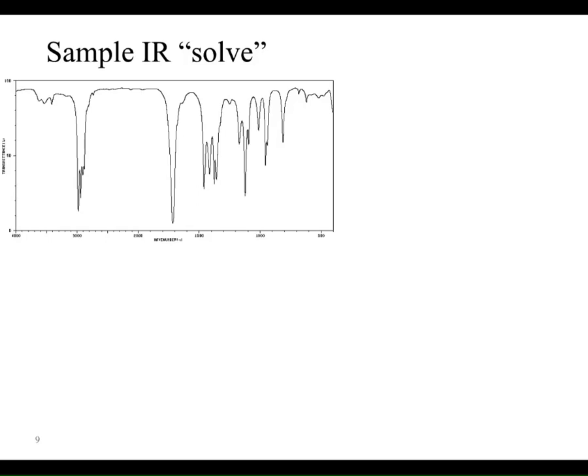So analysis: 3000, that's just under 3000. This is CH sp3. That's a 3 for the record. And then this one shows up, that's 1715, 1716, 1717. This is a carbon-oxygen double bond. That's all you would be expected to draw. Okay? You will notice that there is a sequence of peaks out here. You might say, well, why don't we analyze those? Because those are a tricky sequence of peaks, and we can talk about that if you would like. This is where the practice of looking at spectra comes into play.